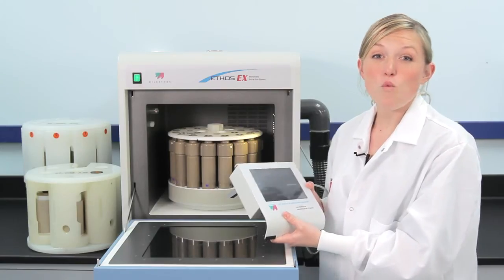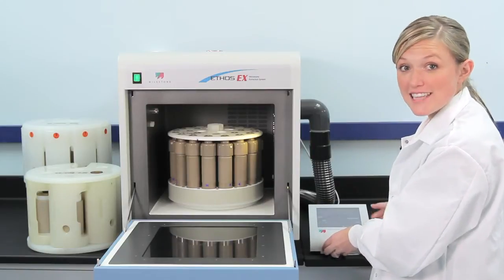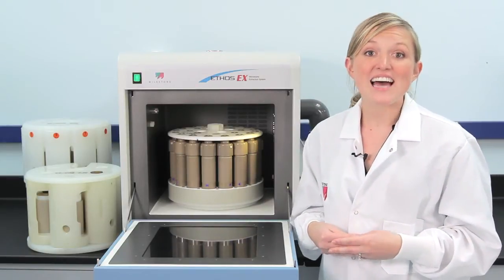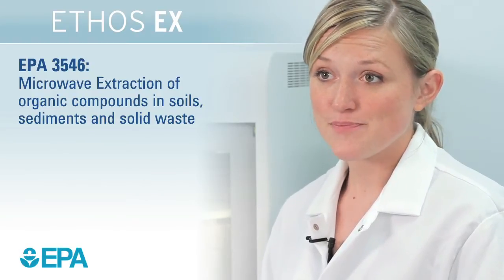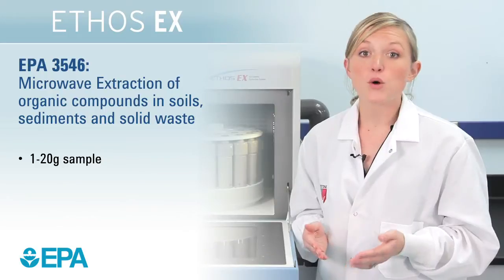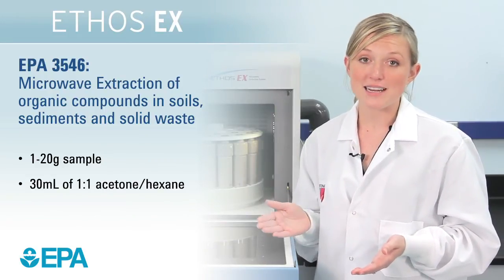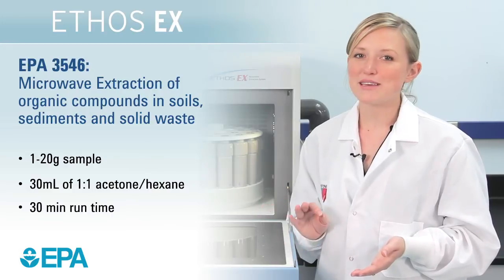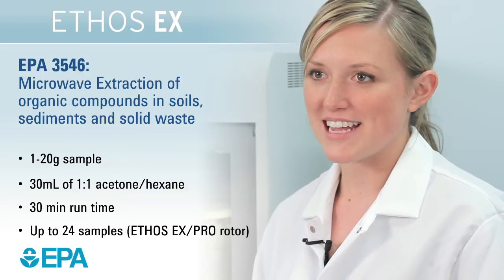Microwave extraction of a wide range of organic compounds from soils, sediments, and solid waste as defined by EPA method 3546. One to 20 grams of sample is extracted with 30 mls of a 1-to-1 acetone-hexane mixture. Run time is 30 minutes and up to 24 samples can be run simultaneously.